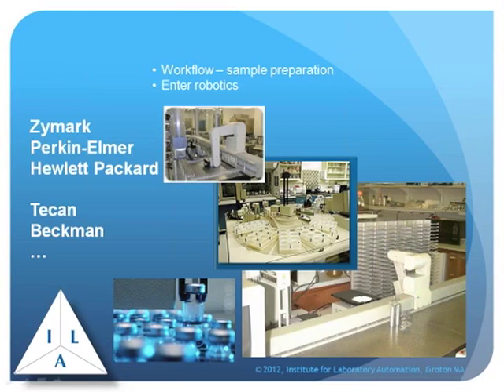The images on the screen show two different styles of robotic systems. The center one is the one that was used by Zymark. That's this system here.